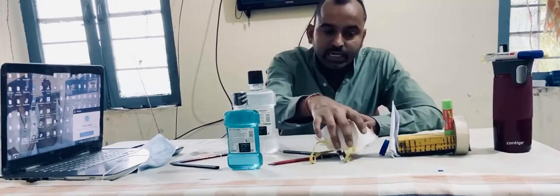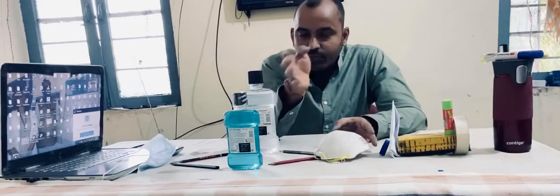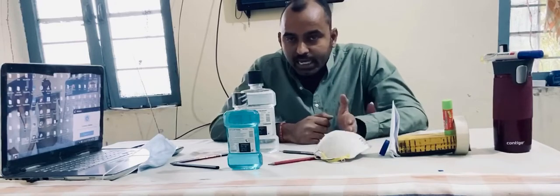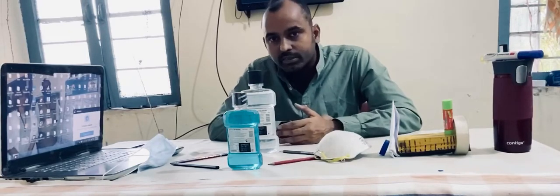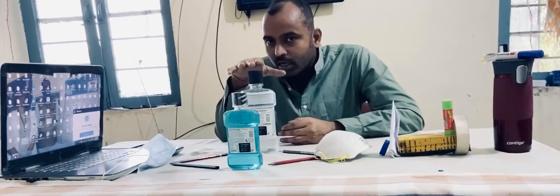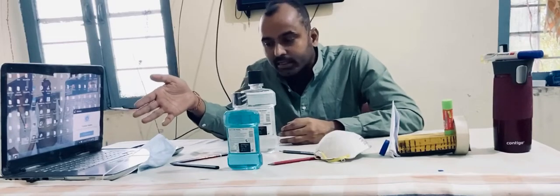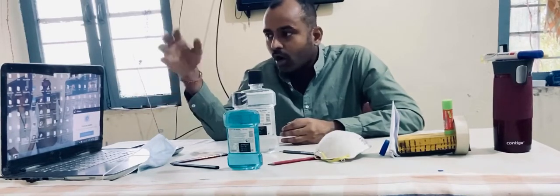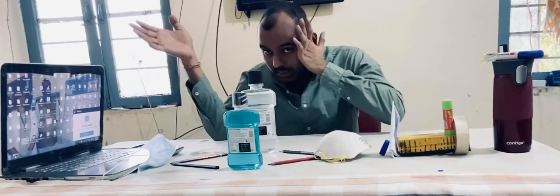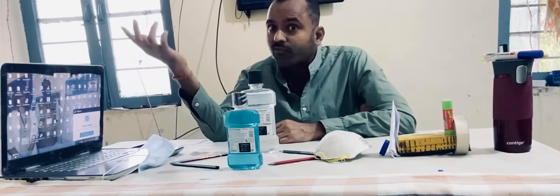So the filter placed just before the sample will select the excitation part for your sample of interest. After that, the light released by the sample falling onto the screen should pass through one more filter. This is called the emission filter.